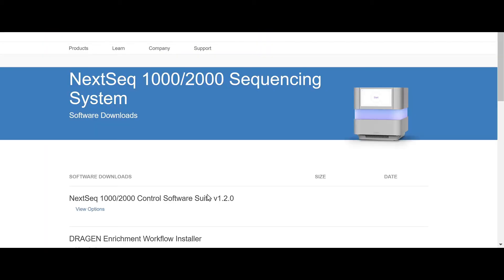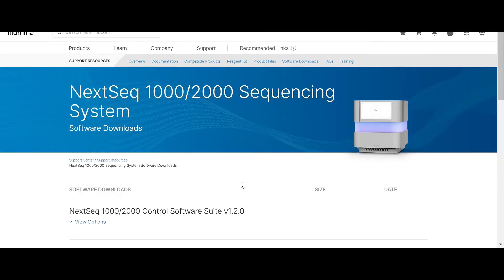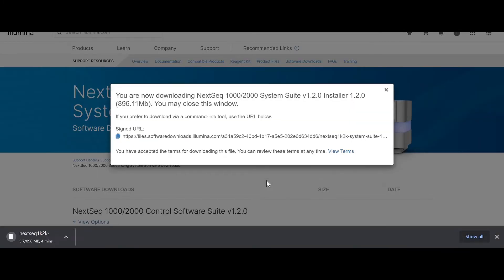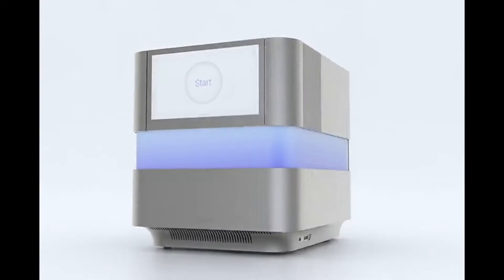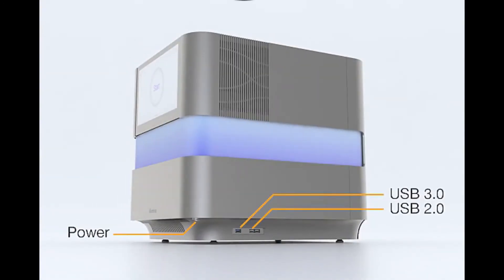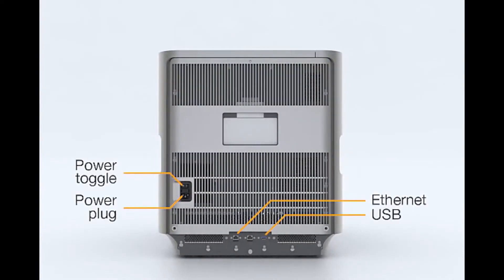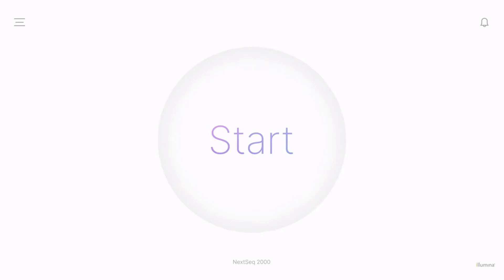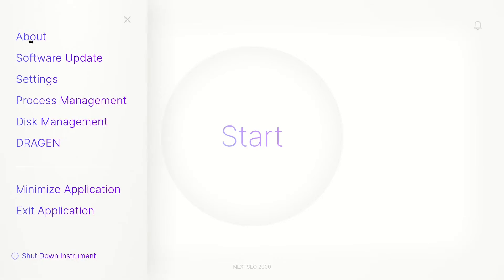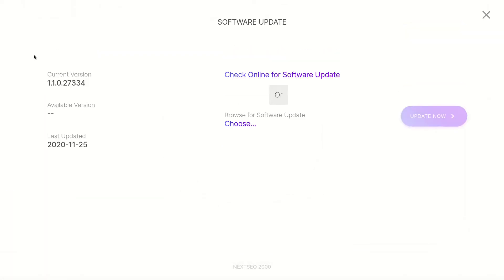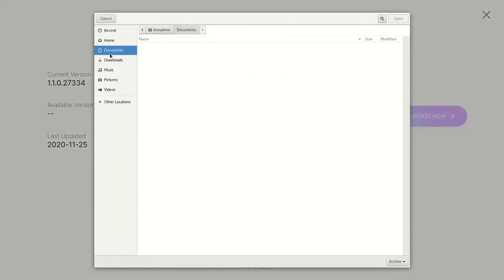If using a separate PC, download the files to a local or portable drive. If you saved the installers to a portable drive, plug the drive into a USB port located on both the side and back of the instrument. From the Control Software home screen, select the menu icon in the top left corner, then select Software Update. Now click Choose to navigate to the installer file just downloaded.